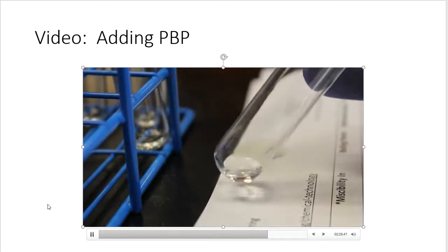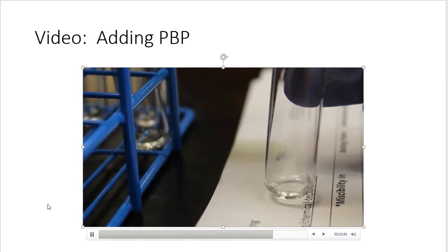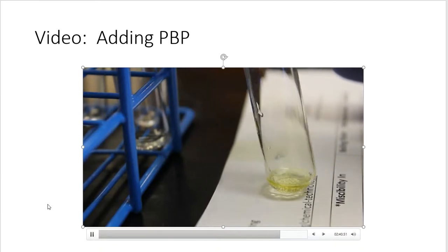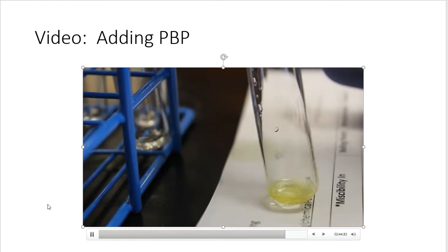Next up, mineral oil, 2 drops. There you go.